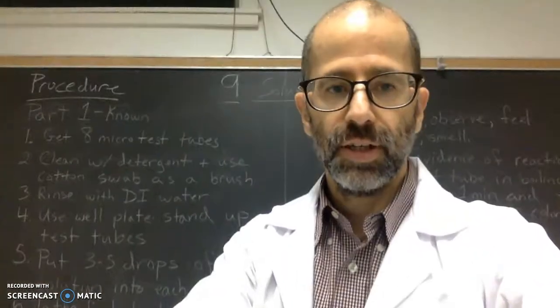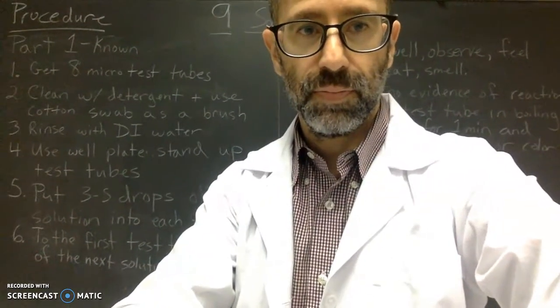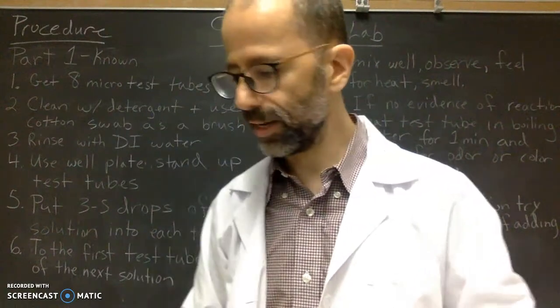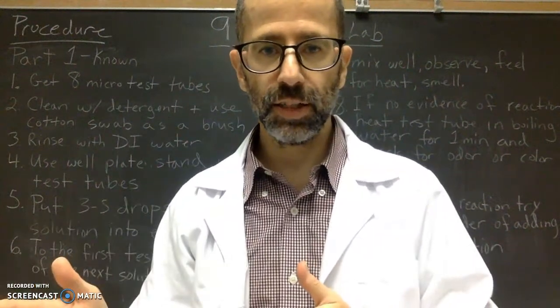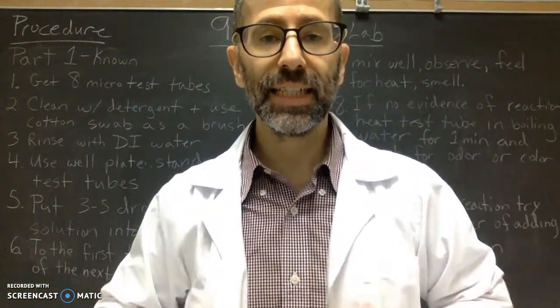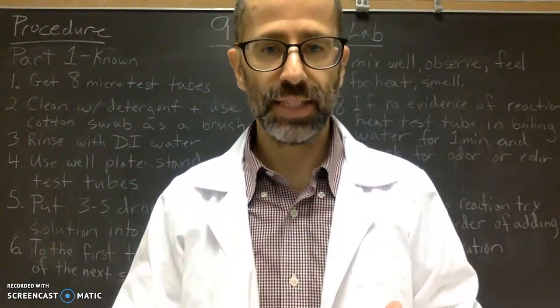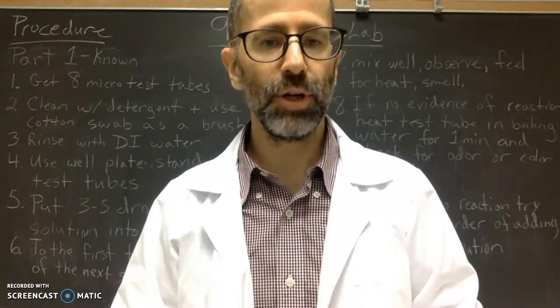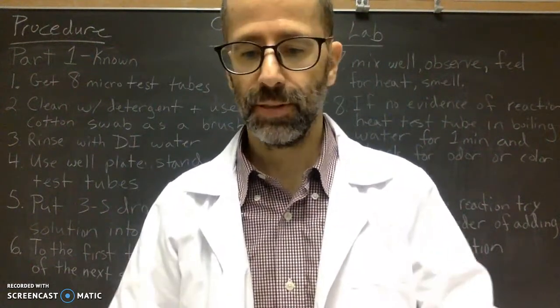So you can see here, once you do that again, you're going to clean the test tubes out, and make sure that you rinse them out with DI water, make sure they're ready for the next set of experiments. And then you're going to fill all the test tubes up with the next substance. And so if I show you my table again really quickly.